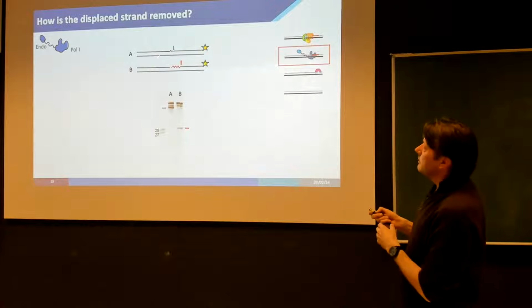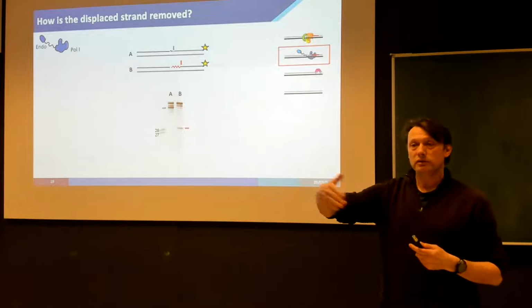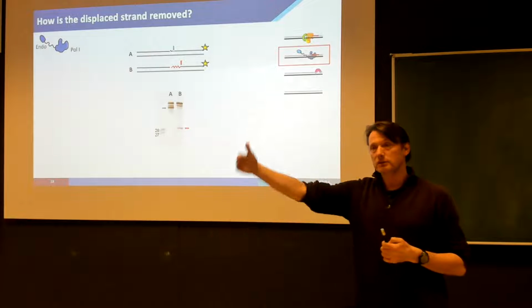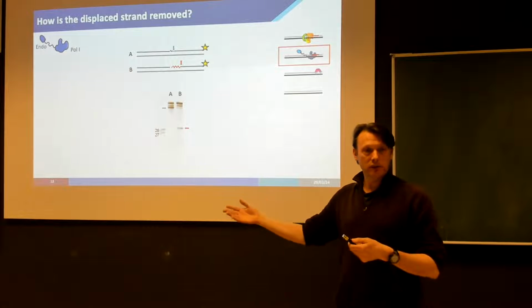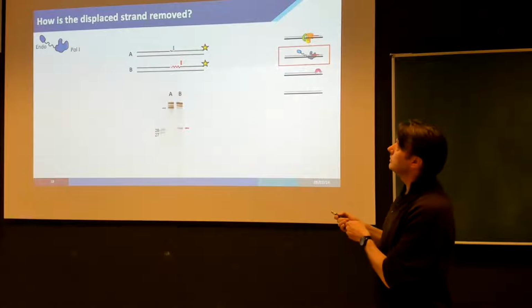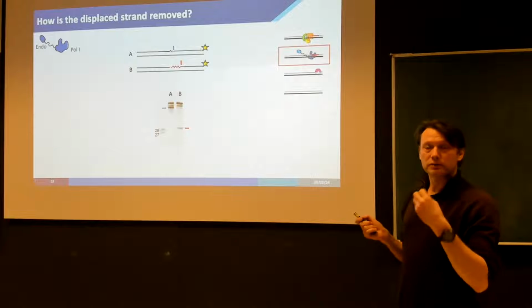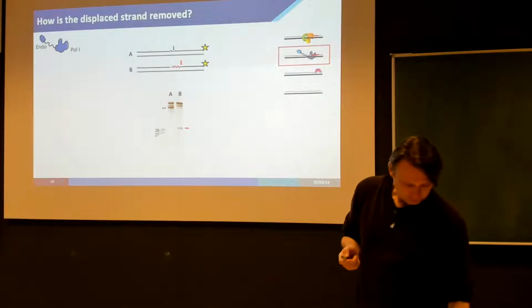And so this is potentially a very useful way to say, okay, this is the end of the RNA primer. I just figured out where the end is. This is the end, and no longer do you need to continue any further. But that doesn't answer everything, because the polymerase could still go through the RNA. Even if it cuts it, it could still go through the DNA. So what is preventing it from going any further?